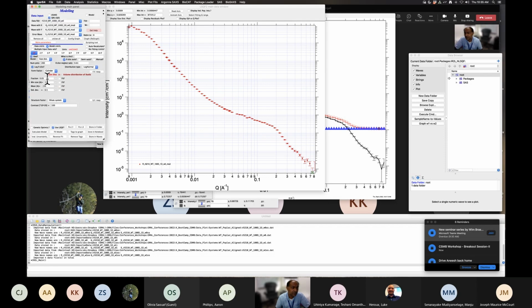Now I want to calculate this model. But before that, I'm going to select log normal. And the Rg, this is the cross-sectional radius shoulder part. That's about 0.2. So a quick estimate would be the inverse of 0.2, and that's 5, right? So I would put something like 10, let's say, or even 8. And the lowest is 3.05, and standard deviation is about 0.5.